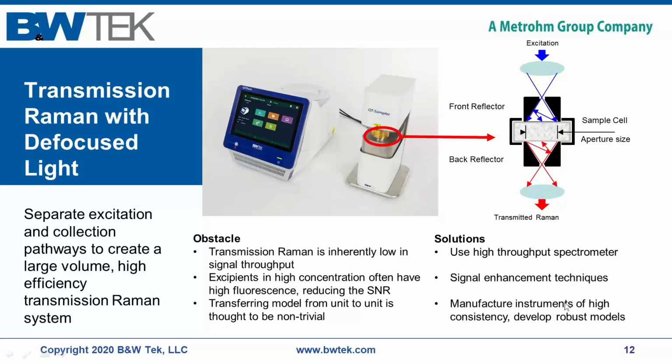Right, thank you for clarifying that for me, Catherine. Is the software validated for use in my QC lab? The BW Analyst software is 21 CFR Part 11 compliant software. Lovely, thank you. Going down to our next question.